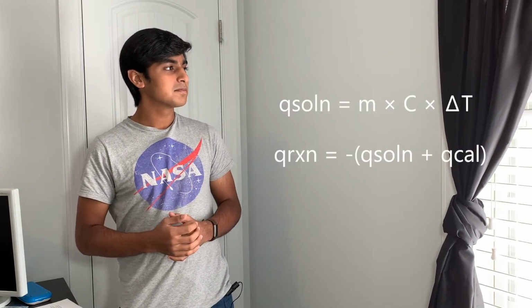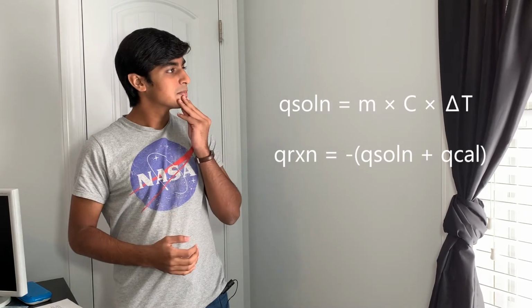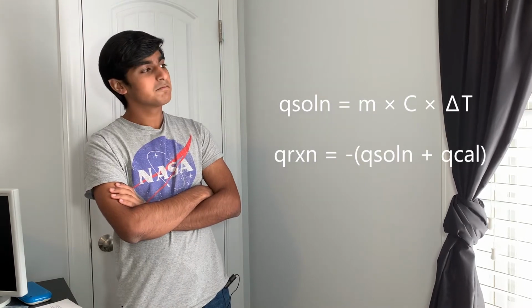And for all these uses, measurements taken throughout the process using the thermometer can then be used to compute the heat transferred using known mathematical relations that are listed here. Keep in mind that Q stands for heat, while the subscript describes what the heat is of. m is the mass of the substance, c is the specific heat, and ΔT is the change in temperature.